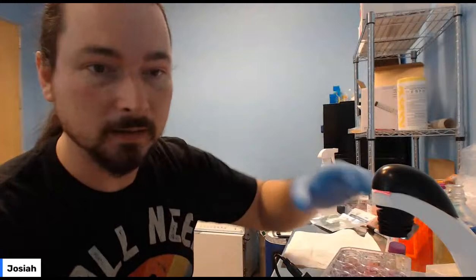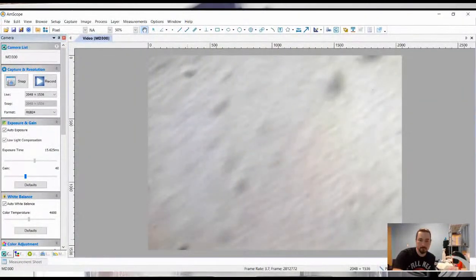But yeah, I'll stick this under here, and I'll show you. But yes, this is a good question. The cells themselves do become blue. Just want to share the screen right now for some reason. Okay.